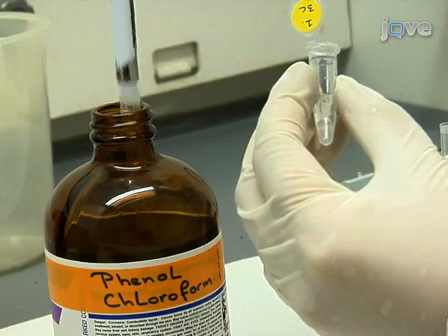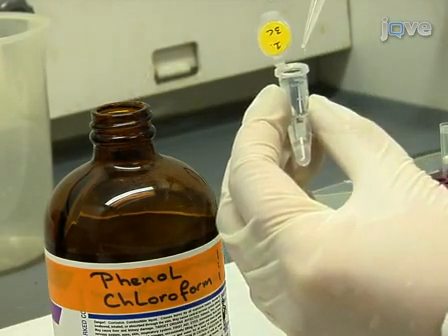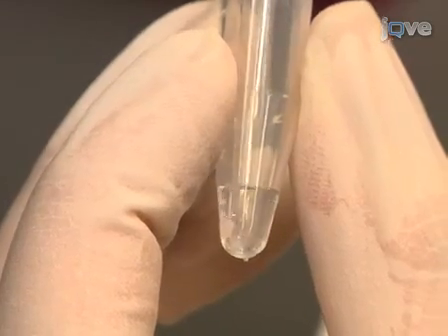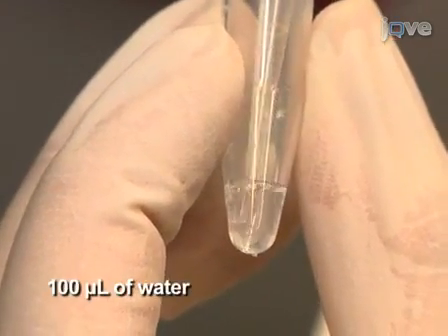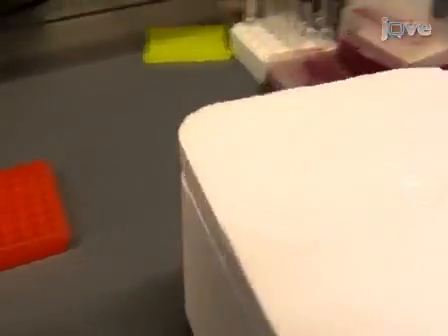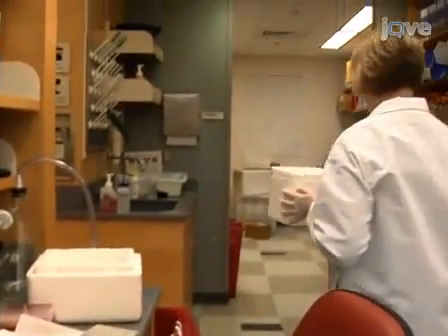Purify the DNA again using phenol chloroform extraction and ethanol precipitation, and resuspend the DNA pellets in a total volume of 100 microliters of water. If the sample has passed the quality control assays, then the protocol continues with biotin pulldown and sequencing.